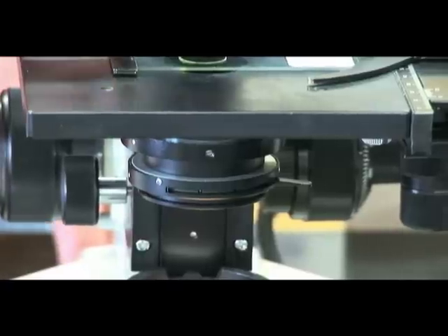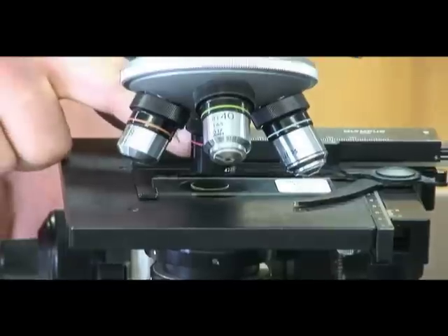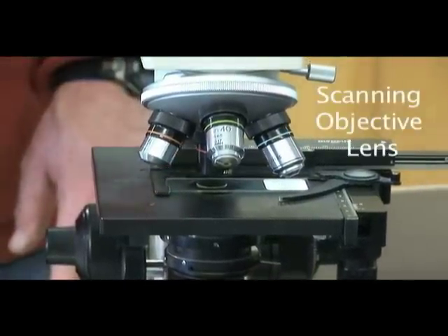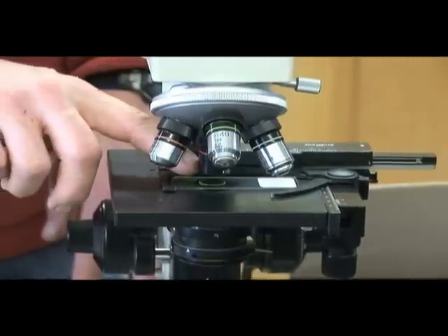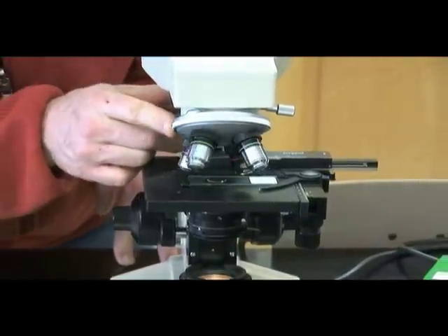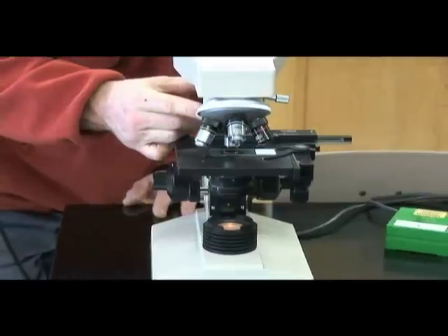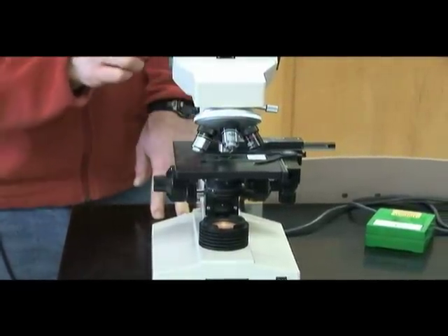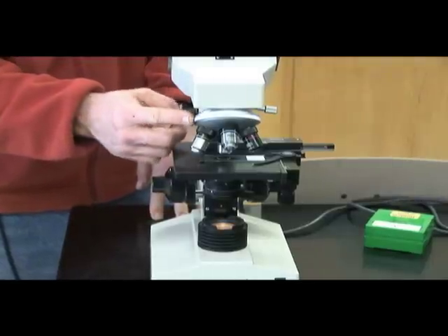And the light then moves through the subject into the scanning objective lens. This is at 4x. If we multiply that times a 10x ocular lens, we know that we have 40 magnification on this subject. If we move forward with using the eyepiece here, the next objective lens says 10x on it, multiplied by the 10 on the ocular, and we know this is 100 magnification.